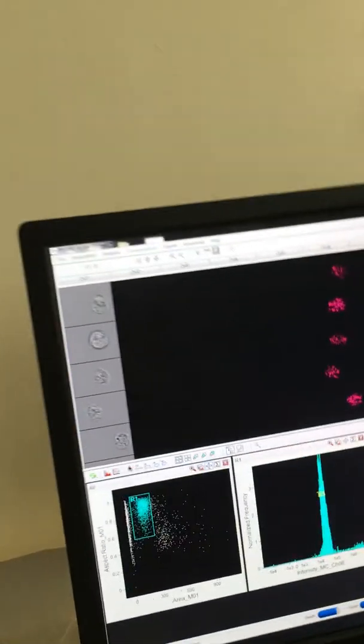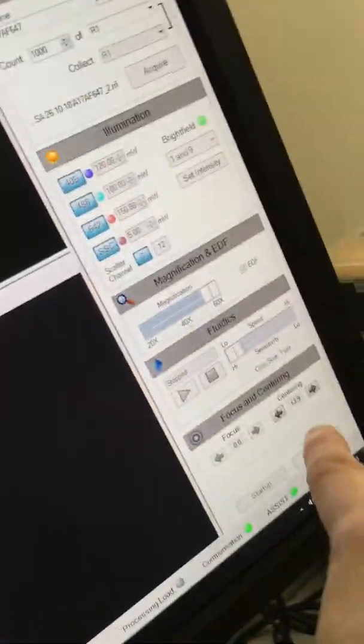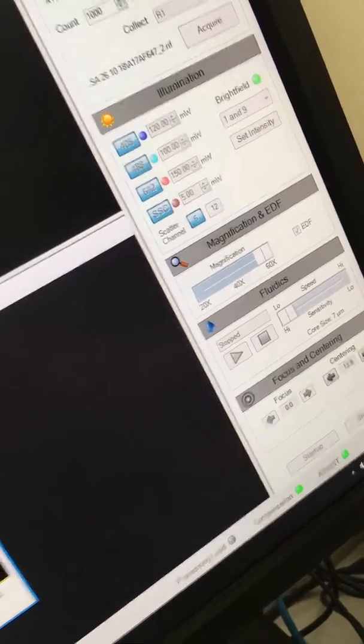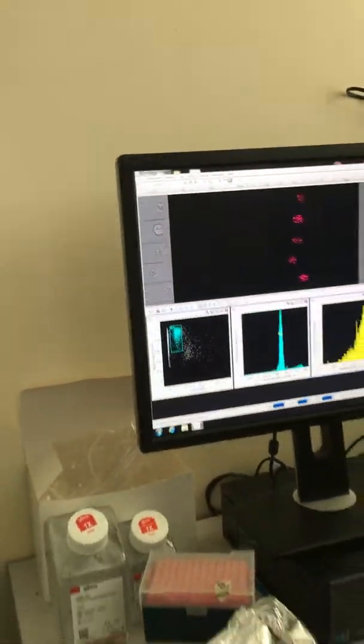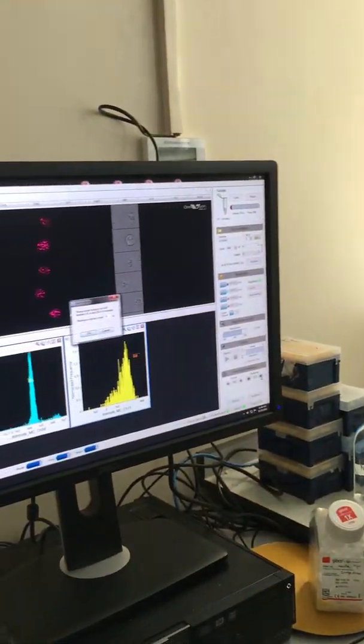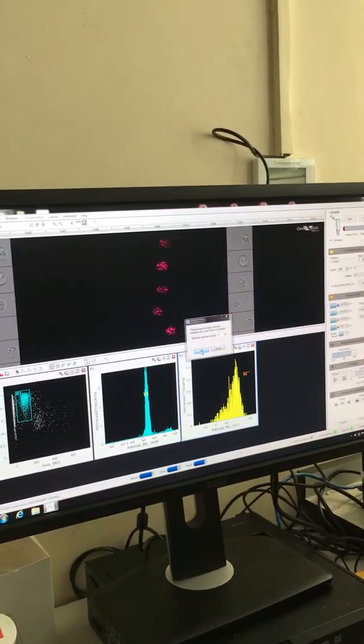So look, you're centering on 13.9, but now when you put the new sample in, that'll reset to 0, so you need to press that button like 3 or 4 times before the next sample runs. Now? Not now, when you've loaded it. That's okay.